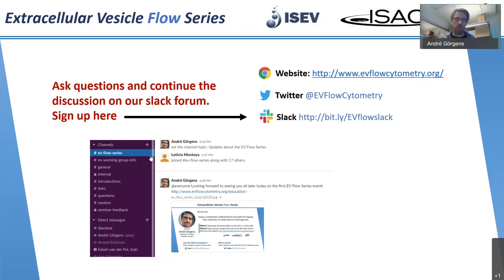When I started, I had no idea how you would do that exactly, and over time, especially with a lot of help from Josh and Joanne, I figured out how to do an MESF calibration, and I have to say it's actually not super hard and it's not very time consuming. It's just something you have to do once, and probably we should have some educational content here eventually, making it easier for people to do it as well.